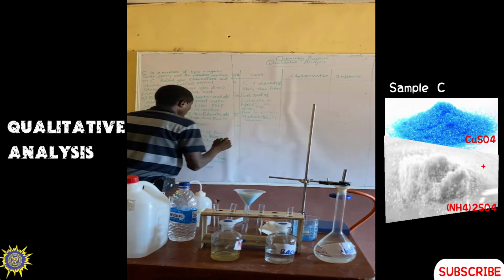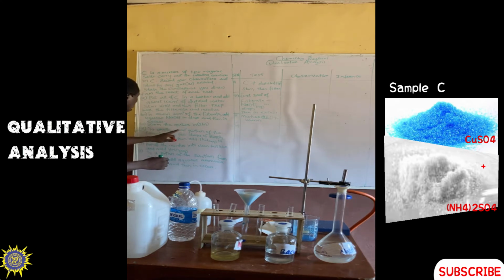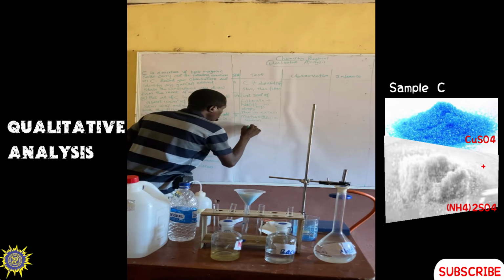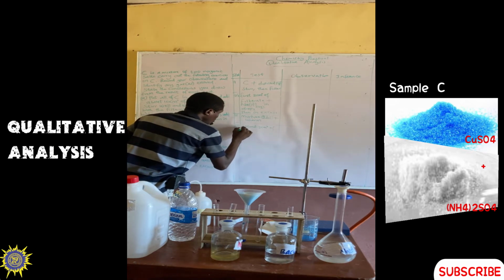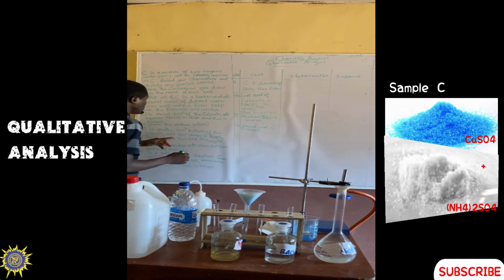Now remember we got 3 of the B. So another 2 centimeter cube portion of filtrate. The second 2 centimeter cube of filtrate.